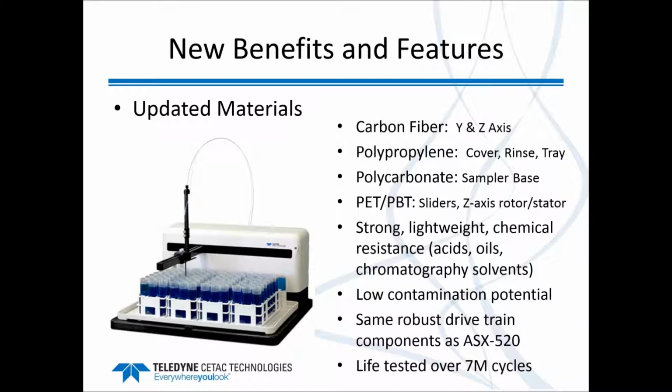And then for a variety of reasons. One is the autosampler lasts longer. It's capable of holding up much better in a robust manner and remaining reliable for long periods of time. But also the corrosion has the potential then of contaminating the samples that are in proximity to it.